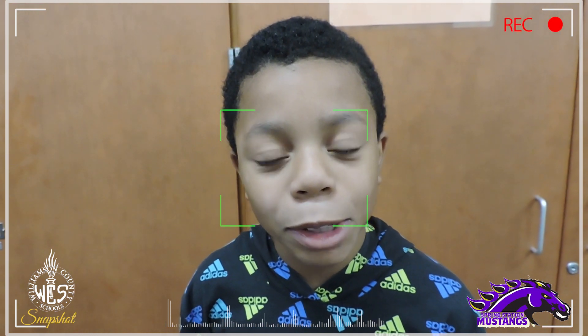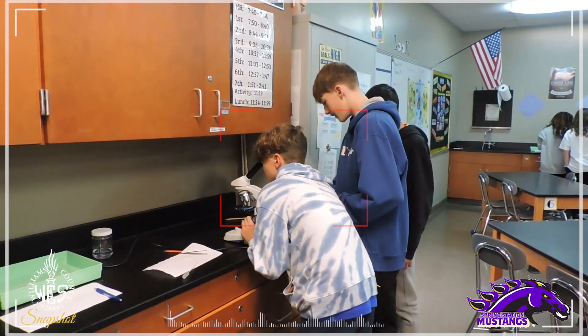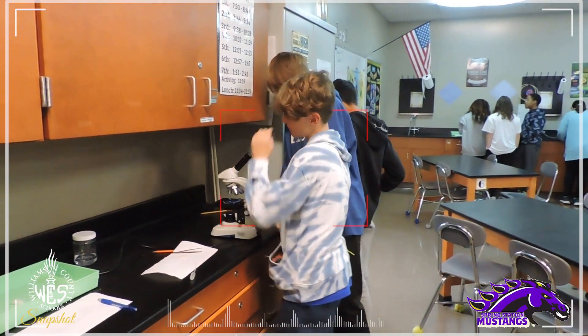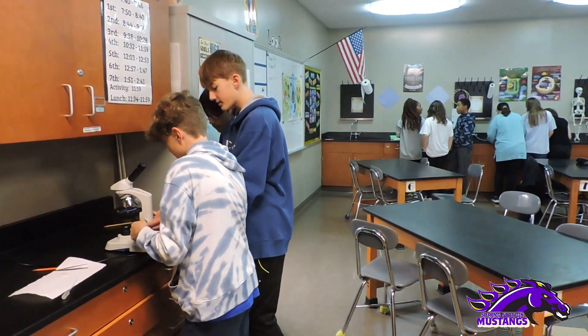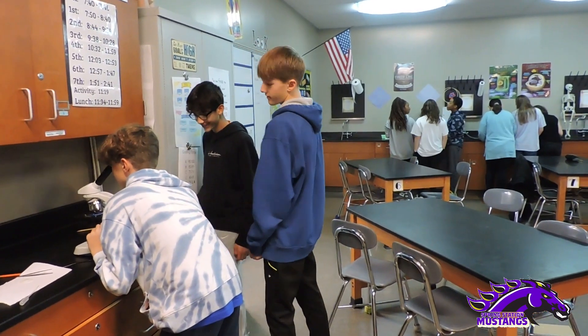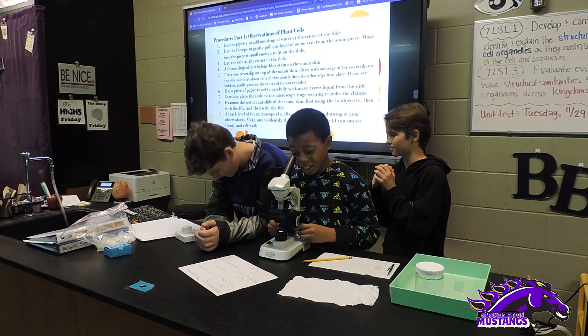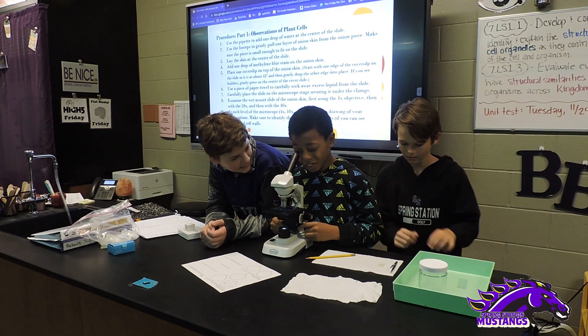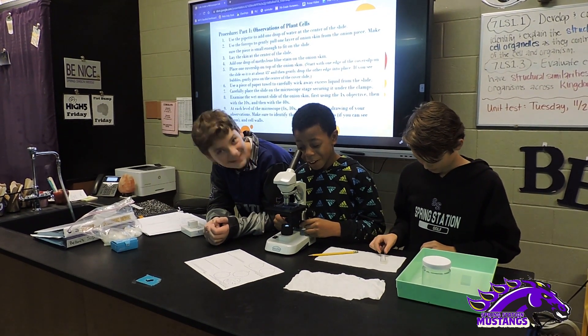Today we're learning about science. We are peeling onions and showing them under a microscope. I saw all different types of cells, like laxoderm.